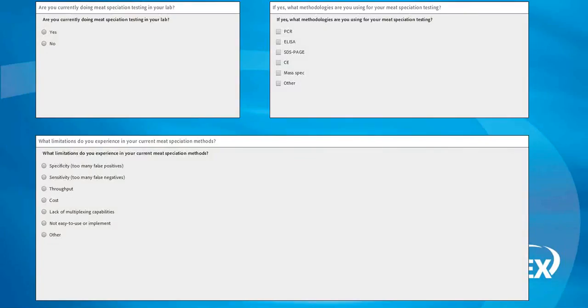What I'd like to ask the listeners to the WebEx today is we have some polling questions that we'd like to ask, and hopefully you can take the time to answer these. Basically, are you currently doing meat speciation testing in your laboratory? So we get some idea of what we're trying to see from here. And there are certainly some interesting results here. 40% of people seem to be showing that they are, where 60% aren't.